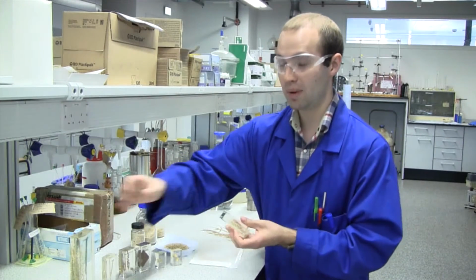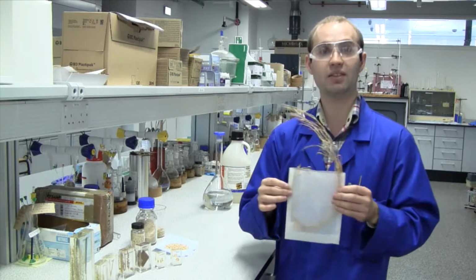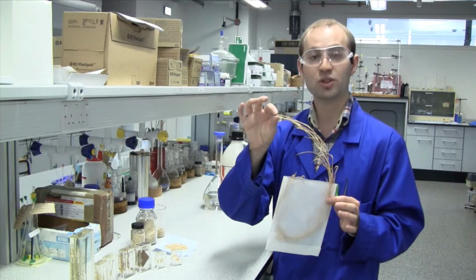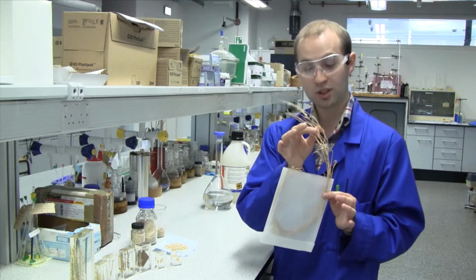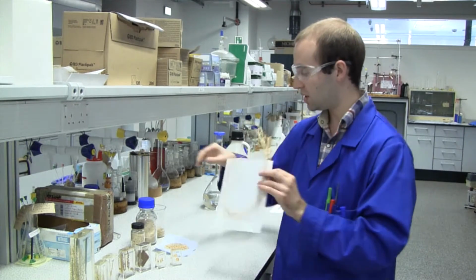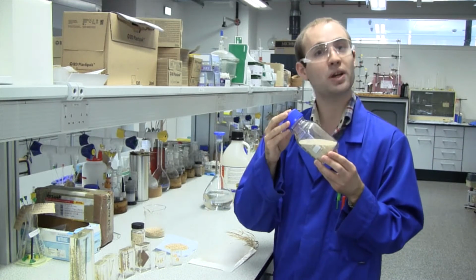Once we've got these biomass materials, they will obviously look a bit like this. This is an example of some maize stover from the field. Before we can use this, we have to grind it down in ball mills so it resembles a fine powder material that we can use in our work.